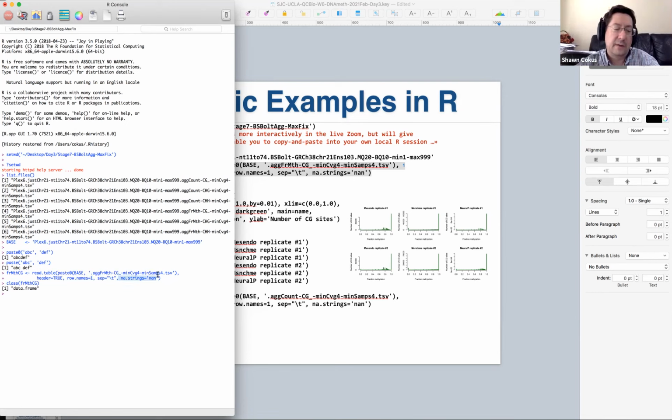And I want you to turn the NaN strings in there into R's NA, right? So R's native not-found missing data is NA. Although R actually also has NaN, with a capital N, lowercase a, capital N. Anyway, the default NA is a logical and the NaN is a numerical thing. So R kind of has both, and it actually understands both of them as missing. They mostly work. And we could have imported it as NaN, but the more traditional missing data value is capital N, capital A. So that's what we imported as.